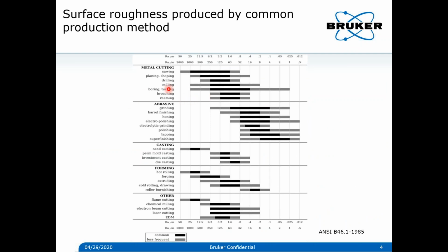on which kind of numbers you will fall in terms of the method which you use. Also, there is another powerful method which we didn't cover today, the PSD analysis. The power spectral density analysis is a Fourier transform analysis actually. What it will give you is the kind of length scales present in the surface. So that is also a deciding factor in selecting the cutoffs. Yeah.